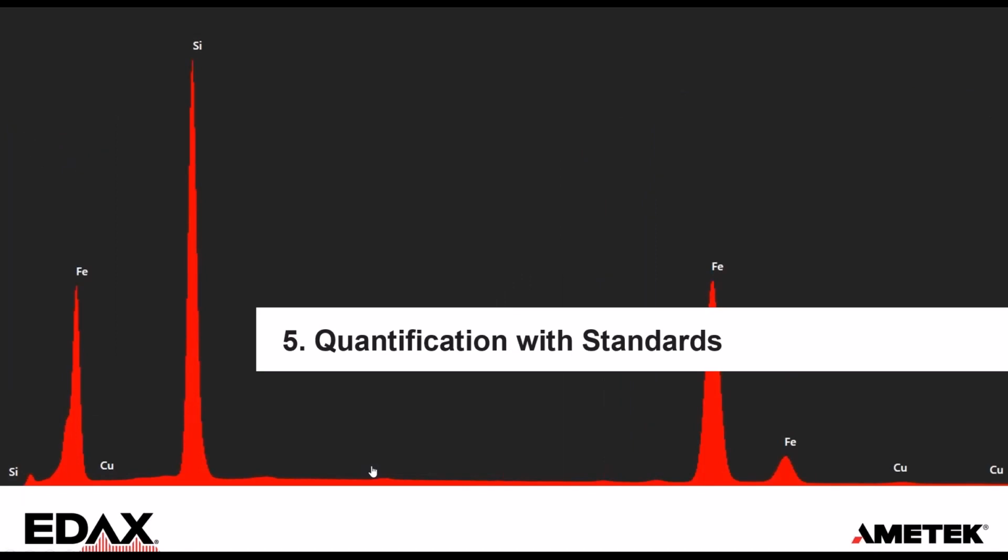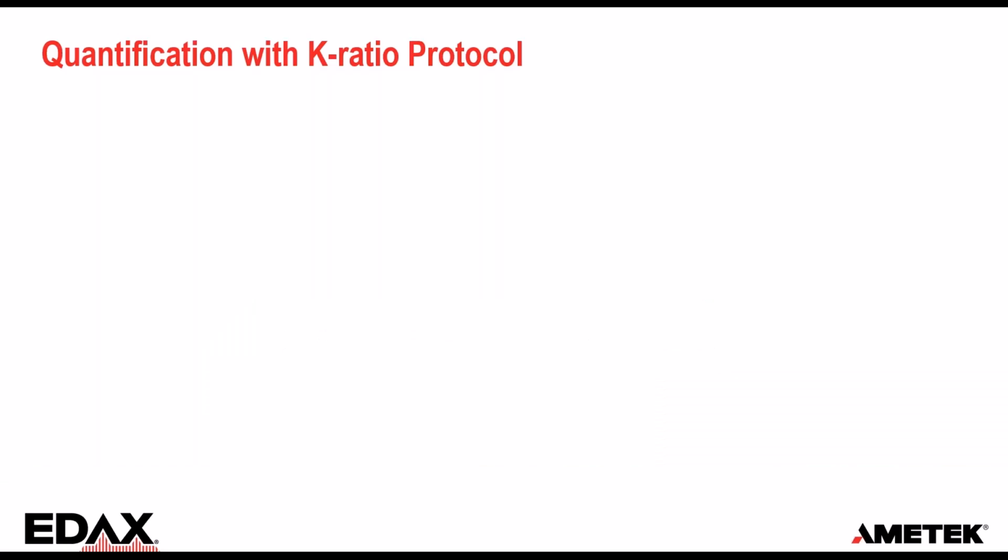Okay, let's go into quantification with standards. So briefly to mention what quantification with standards usually looks like, that's what we call the K-ratio protocol.